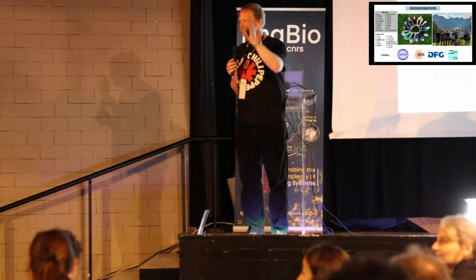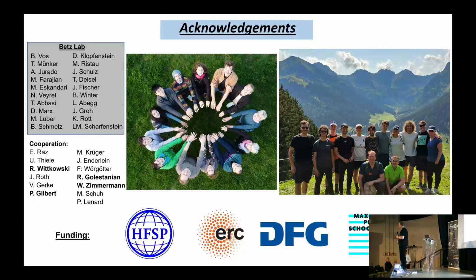Thank you very much for your amazing talk. I was wondering, with your tumor assay, your spheroid, it's usually monoclonal cells. Have you tried to do the same with tumoroids where you have higher heterogeneity? And in that case, do you have a collective migration of a few cells based on their state that are the only ones able to migrate or to move?